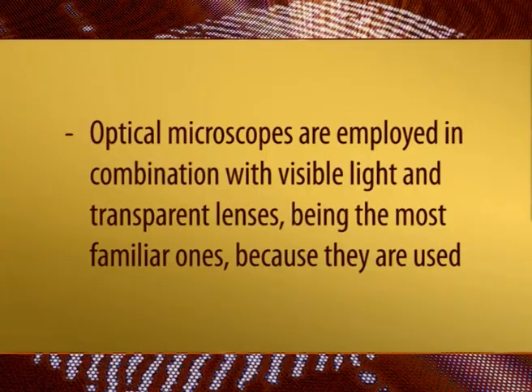These microscopes have paved their way in the field of forensics too. They are being used for analysis and examination of samples. Few applications of various microscopes have been listed here. First is the optical microscopes.